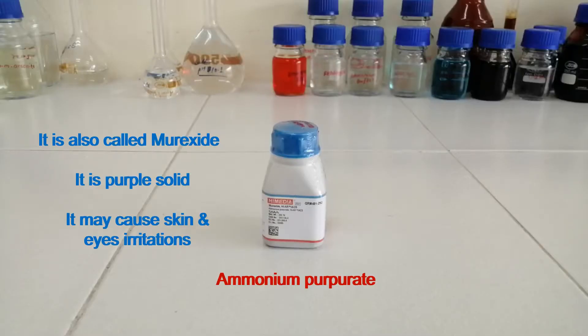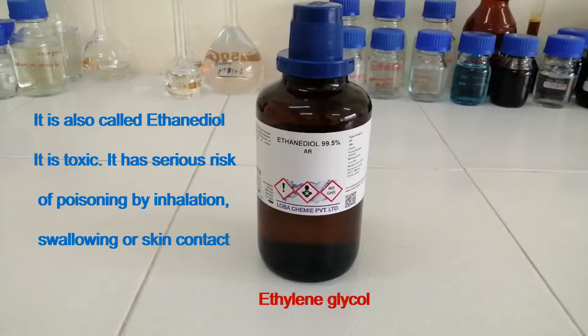This is ammonium purpurate, also called murexide. It is a purple solid. It may cause skin and eye irritations. This is ethylene glycol, also called ethane diol. See the hazards: it is toxic and has a serious risk of poisoning by inhalation, swallowing, or skin contact.